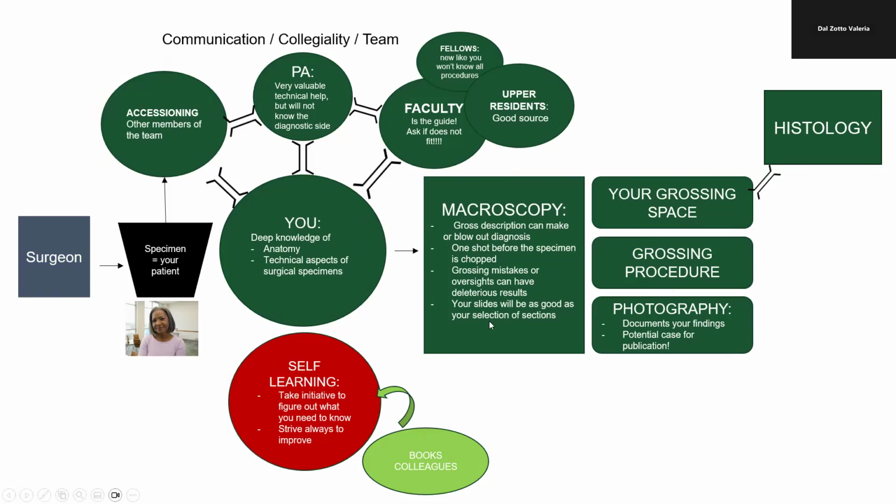All of this that you do in the gross room is going to impact the other team, which is histology. Histology is the team that is in charge of the processing, embedding, and cutting for microscopic examination, your blocks, your sections. So all of this is part of a community. So I highly encourage you to communicate with all of this team constantly, especially with upper residents, peers, and PAs and the accessioning team.